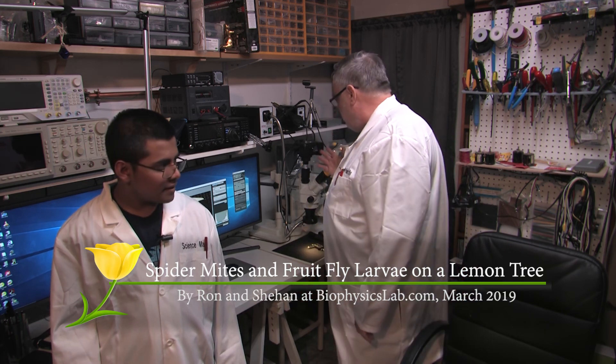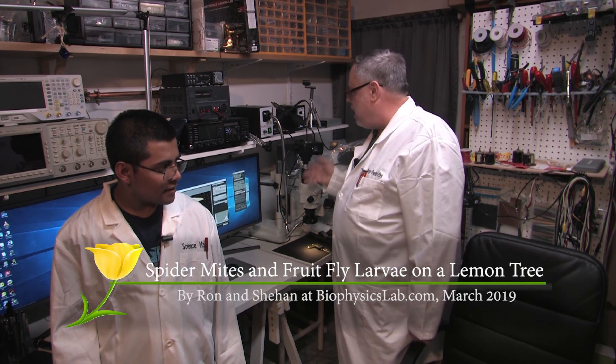My name is Shehan and I like science and math. I'm Ron and we're here in the biophysics lab to demonstrate two of the pests that can live on a citrus tree using our stereo microscope and camera computer setup.